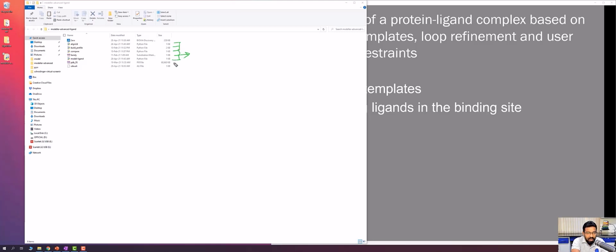And this PDB95 file we already used. This file contains the amino acid sequences of all the protein molecules which are already deposited in the Protein Data Bank. And this is the target sequence. I told you that I already downloaded the target sequence. I prepared it in the ALI file format, and I saved that file as sdia.ali. So that is the target sequence.